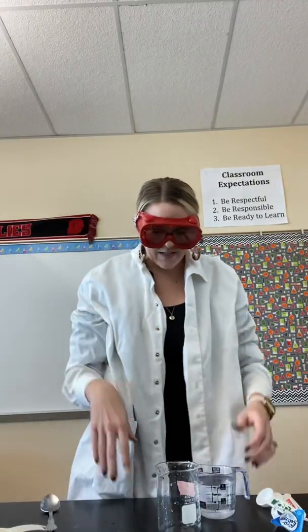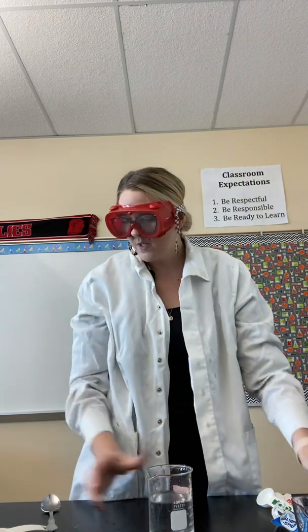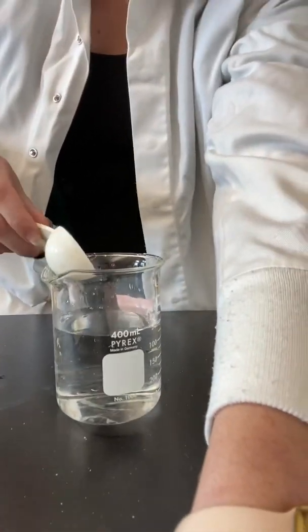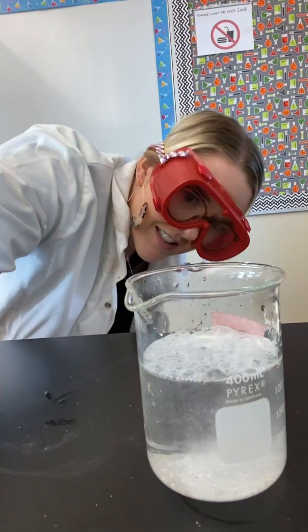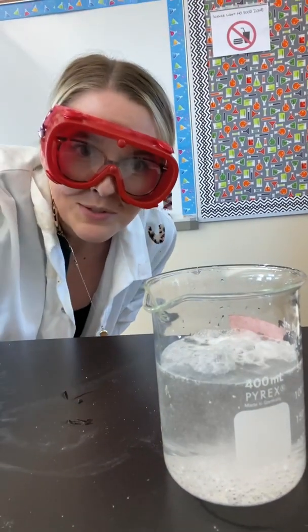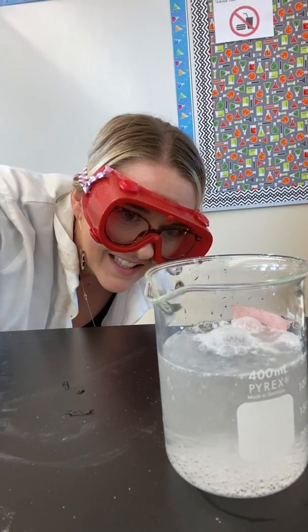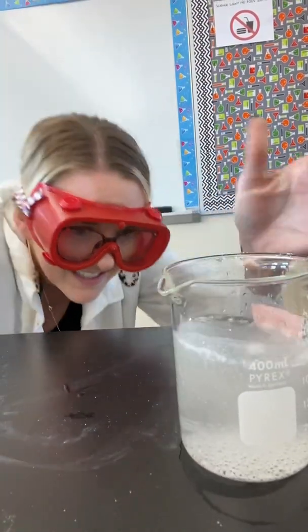All right, last one. So we're gonna add in our cup of water. And remember, this one is the one where I took half a tablet and I crushed it into a powder, okay? So get your timers ready, set, go. Still reacting. I have to get a little bit closer to this one. And time. All right, hopefully you got the times on all 4.